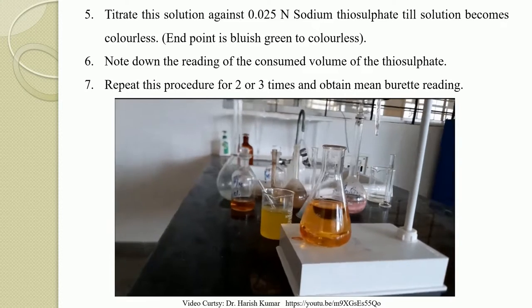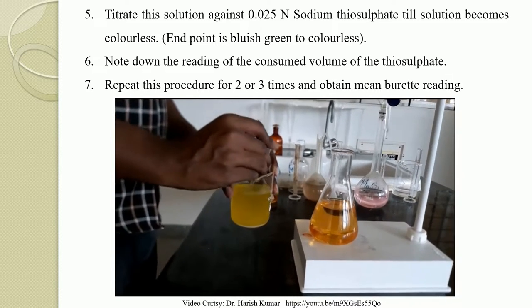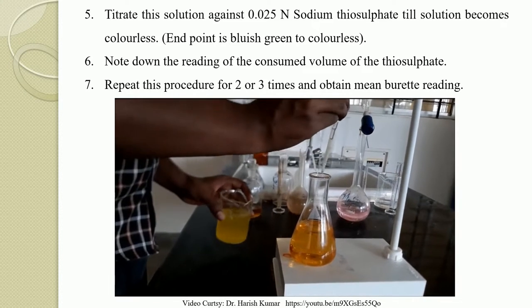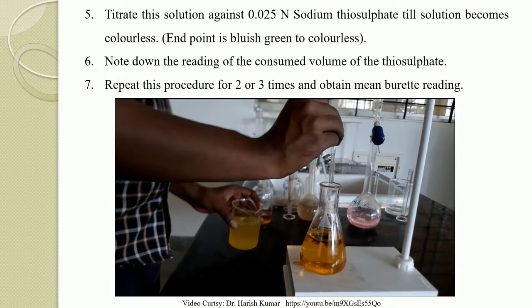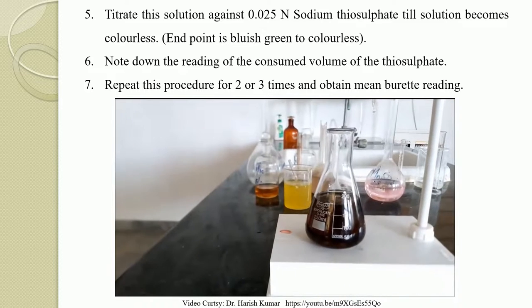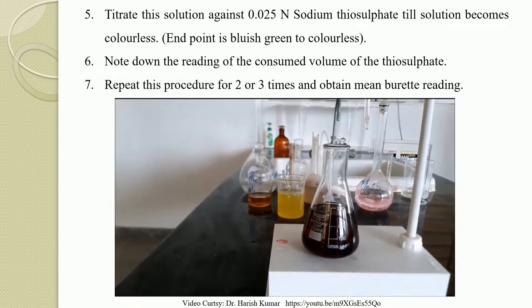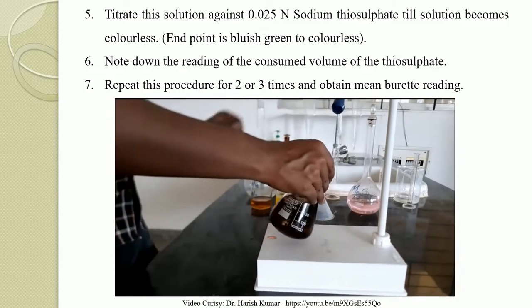A few drops of starch are added to the titrated solution now. After the addition of starch, it has turned to dark blue color. Now titrate it until it appears to be colorless.